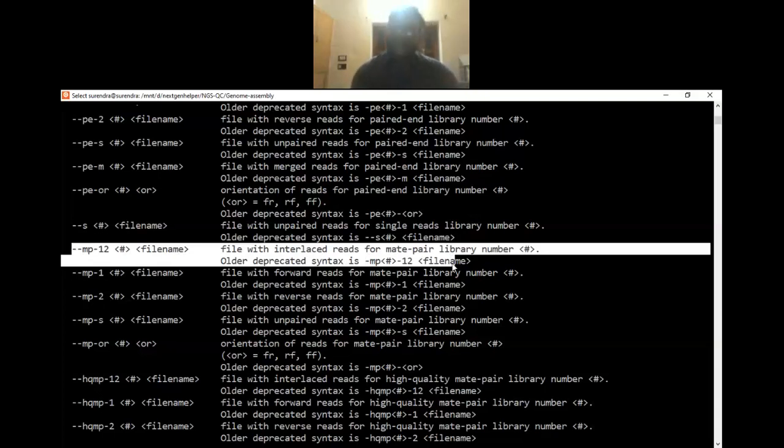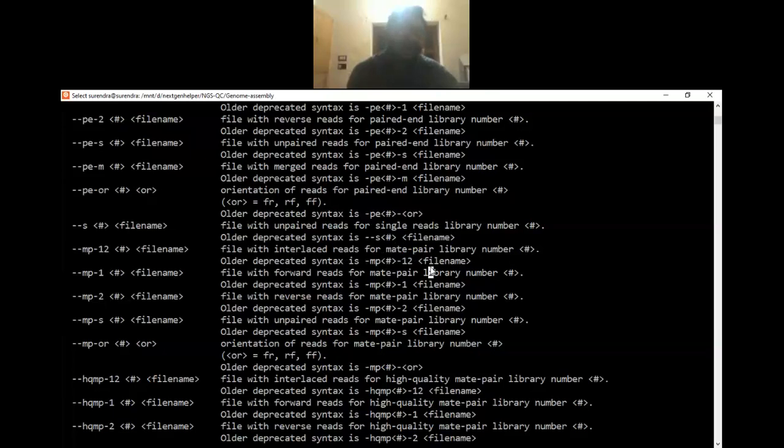Sir, can we use BWA for alignment for genomic DNA? Yes. I mean, instead of SPAdes or something like this, an online database, an online type of tool, can we use that? Yes, sure, you can use it. There is a portal available, KBase. That is up to us.